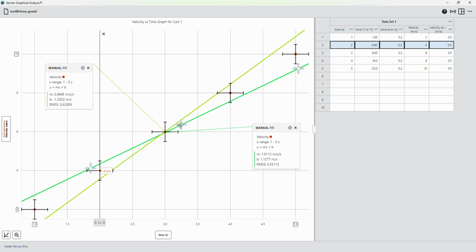So now I can go up and down like this, and maybe I have to bring this one down a bit. So you do have to play with it a bit. You have to experiment and test it.